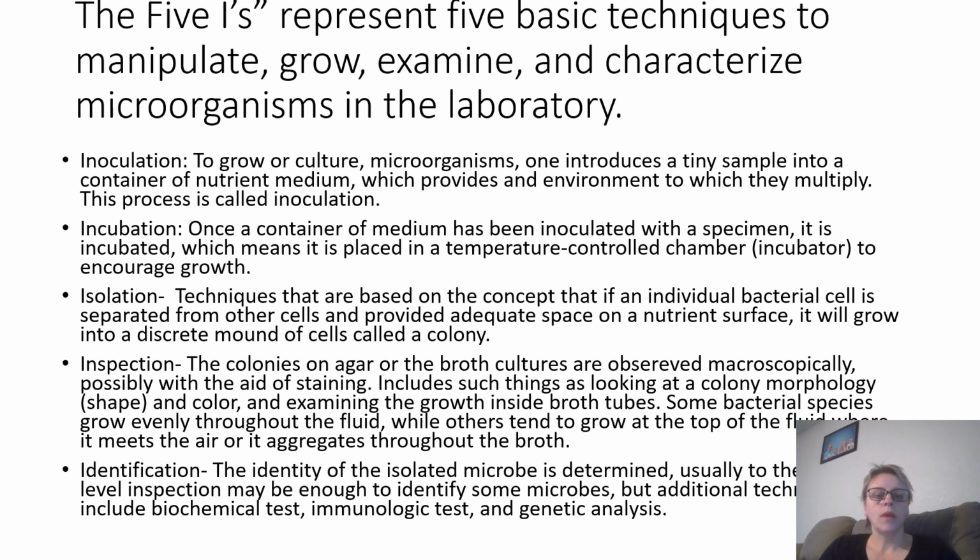Incubation. Once a container of medium has been inoculated with a specimen, it is incubated, which means it is placed in a temperature-controlled chamber, an incubator, to encourage growth.